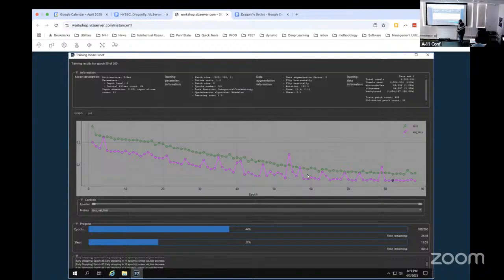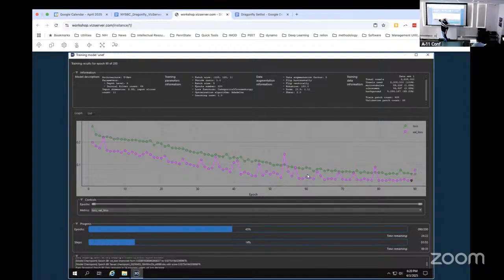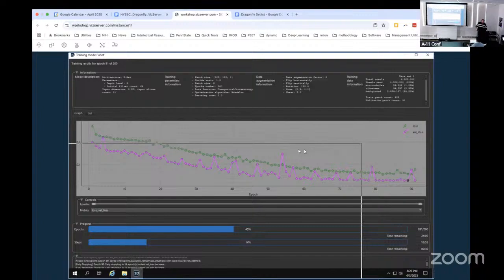You can also end the training anytime. You can just hit stop, and you can always restart it, it's not hard. It saves the result for you as it's going, so it's auto saving. Anytime the model gets better, it saves it. That's what that little triangle indicates, the last checkpoint that it's saved on. So I'm gonna hit stop, if I can even find my stop button.